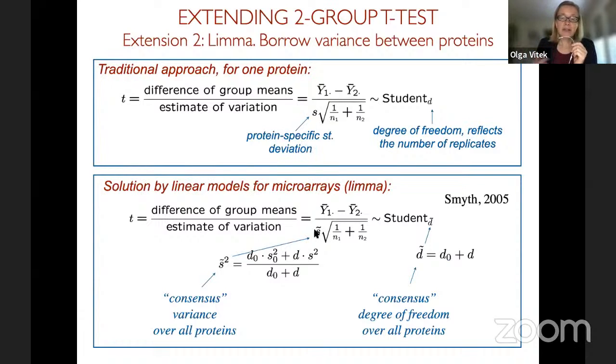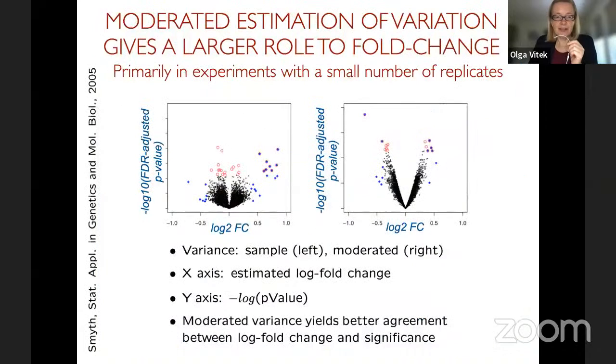In practice, our experience is that if you have more than 3 replicates, there is really no need for that. This works just fine. But if you have designs which are more complicated than just comparing several groups, then the noise part, the signal part, is not quite sufficient in what limma is doing for the purpose of quantitative proteomics. So we implemented this especially for TMT. I think we haven't done it for the Bayes MStats because people now tend to have larger sample sizes in their experiments, so it's not as relevant.